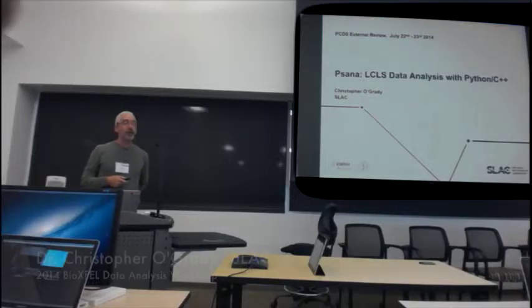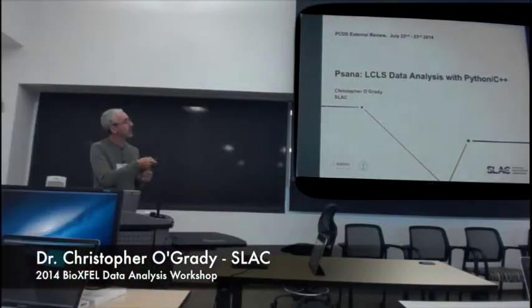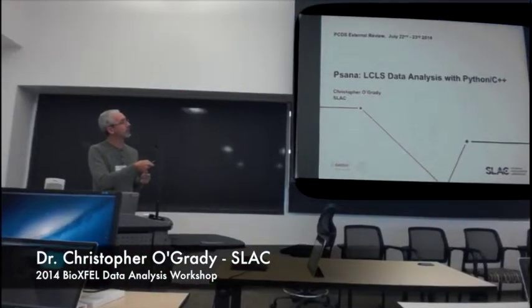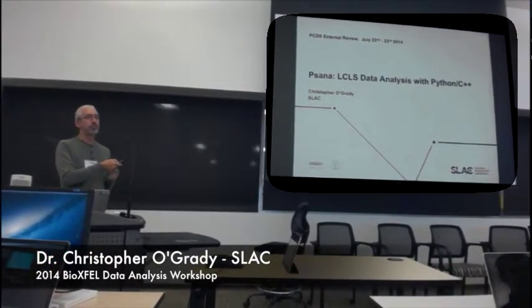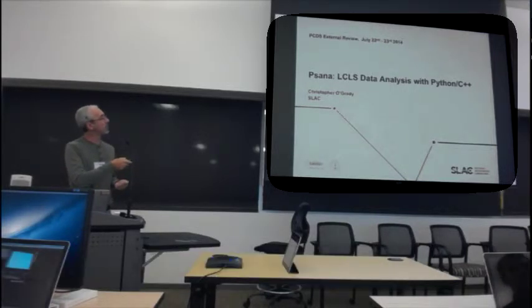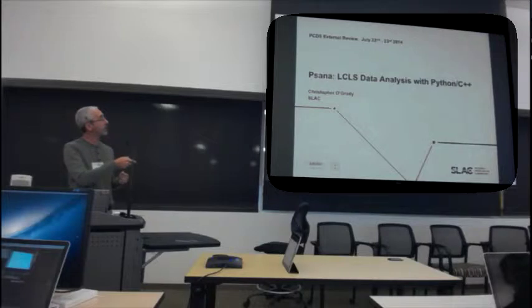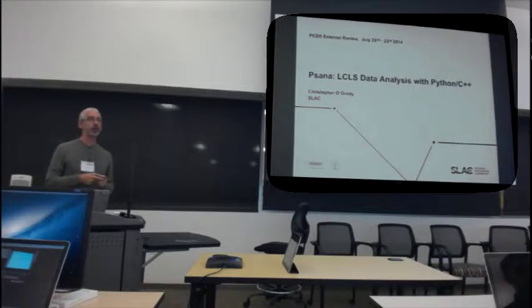So I'm going to talk about Psana, which is kind of the LCLS-specific data analysis. There are advantages and disadvantages to this. If you move between experiments at different places a lot, maybe something more portable, like we're thinking at the higher, more portable level of CCTBX or CAS or something like that might be better. But the advantage here is that we support everything at LCLS, so not just crystallography, but all the other experiments that happen.